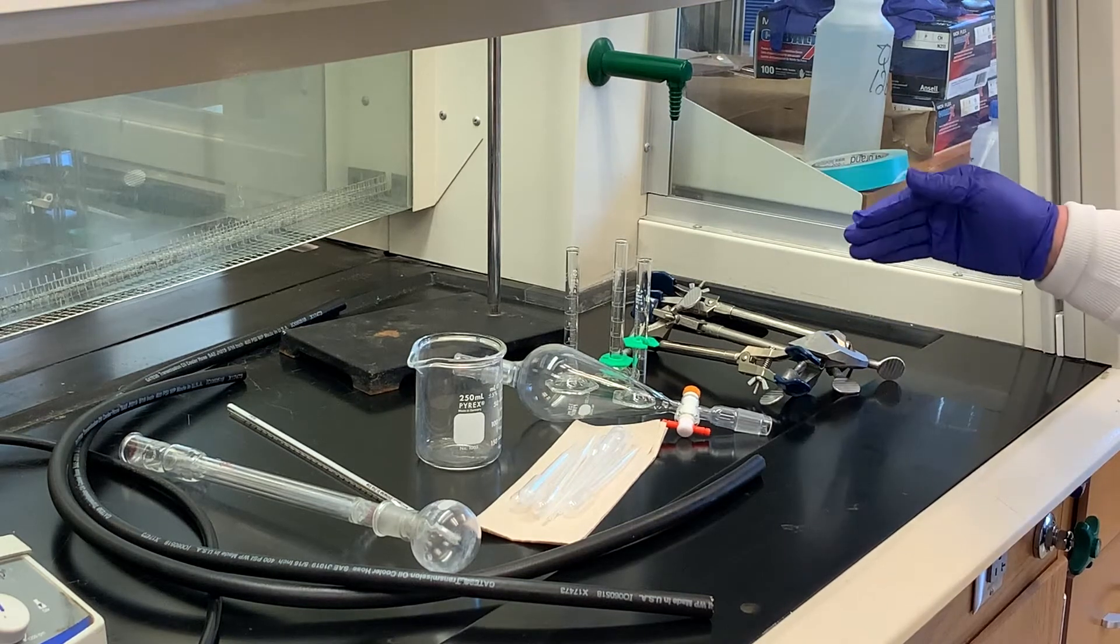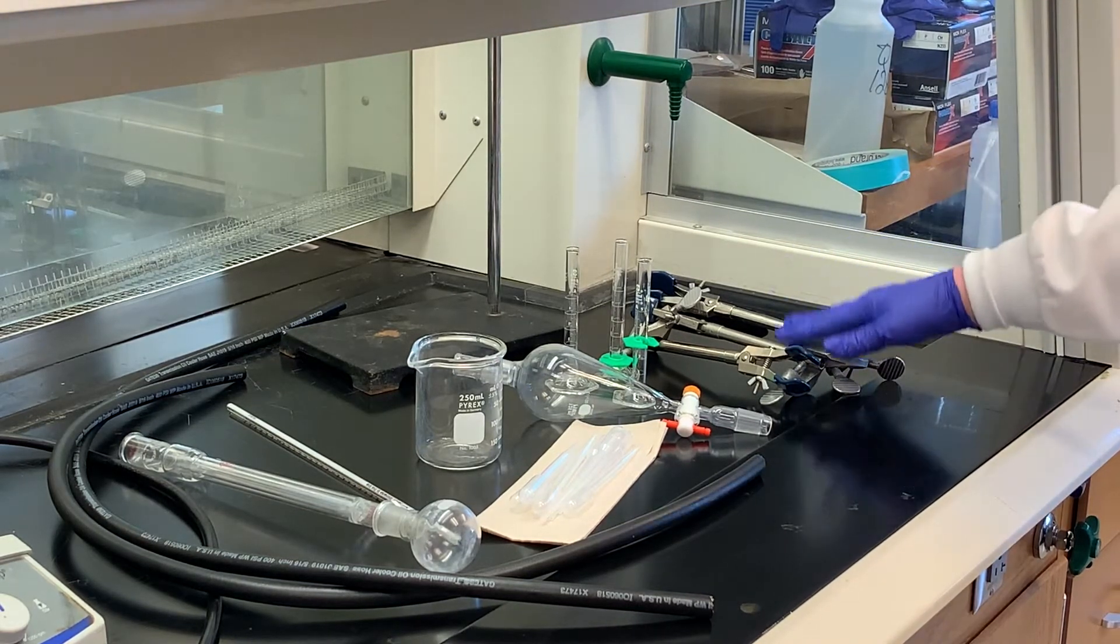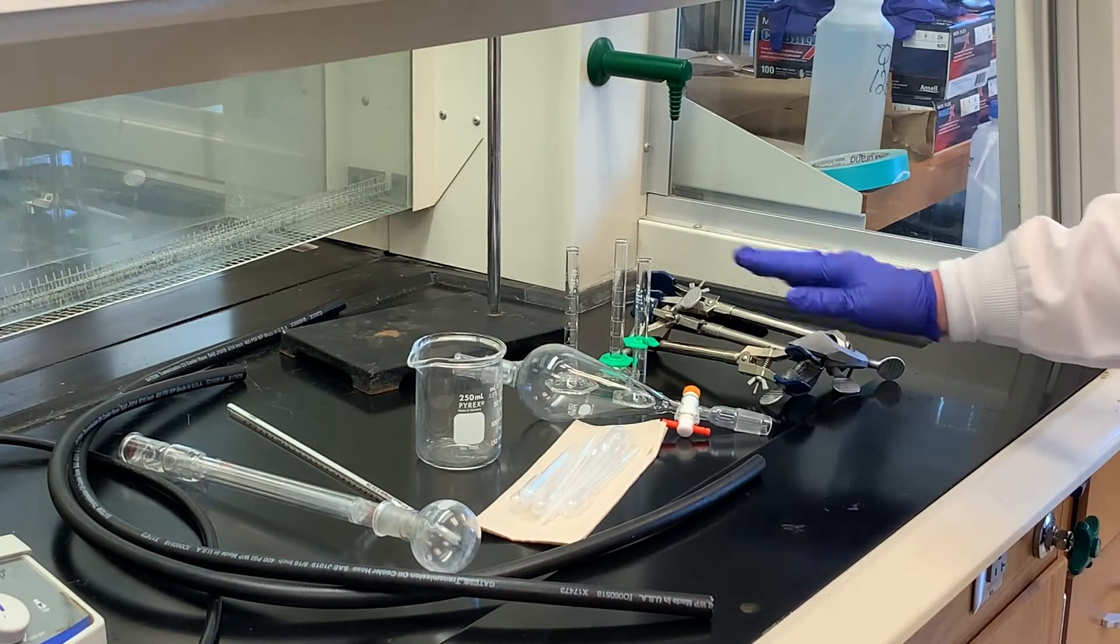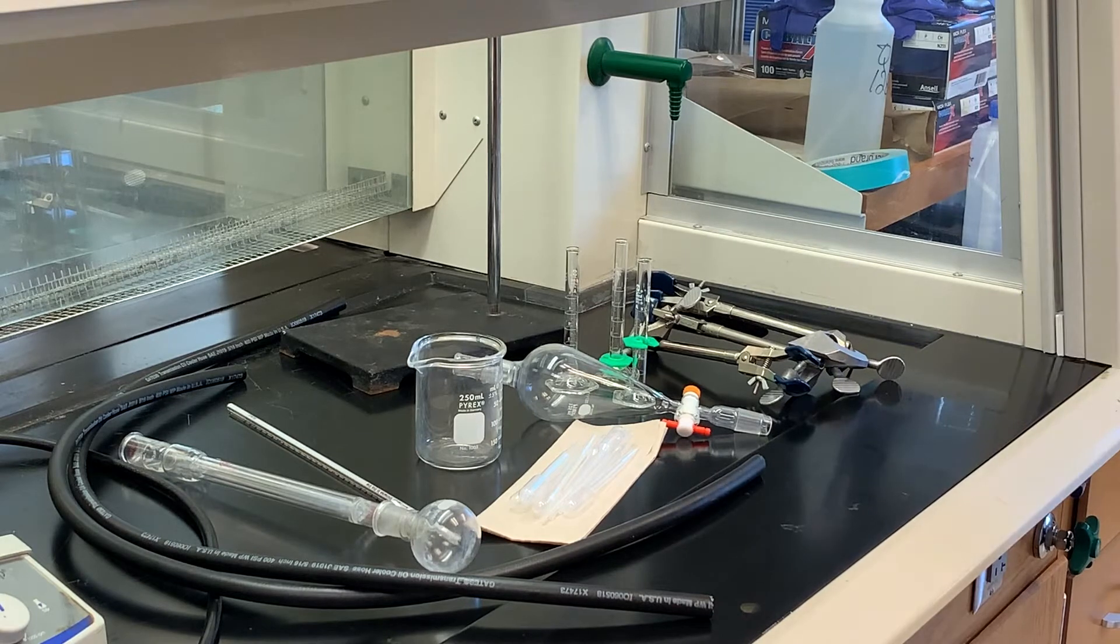Graduated cylinders—you need fairly small ones because the amounts we're using are not very great. Clamps to clamp the glassware in place, pipettes, and of course the water going in and out of these rubber tubes.